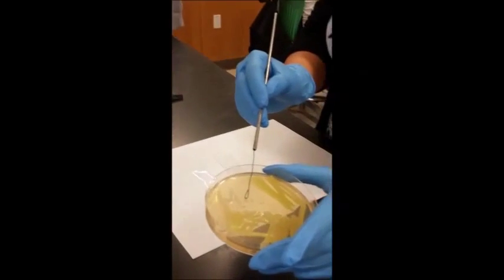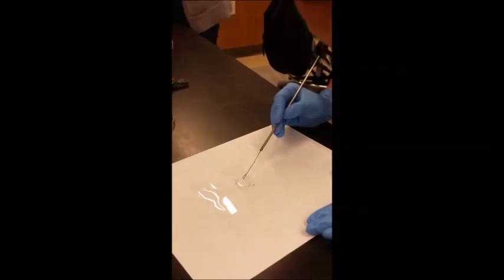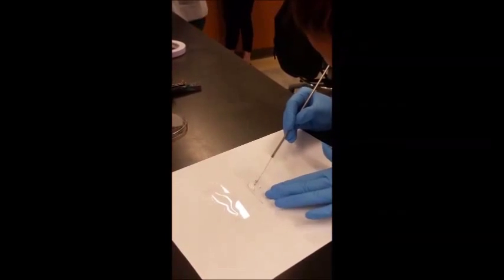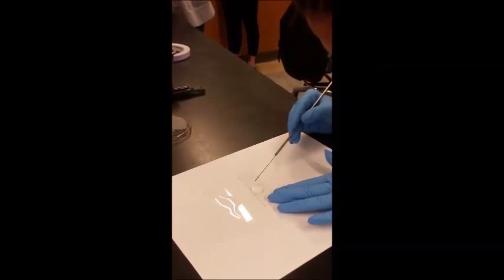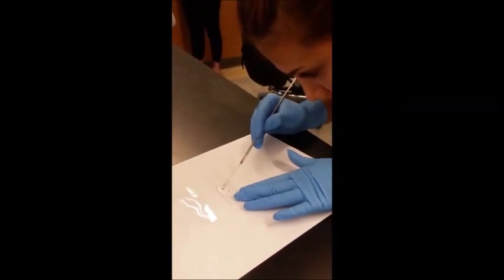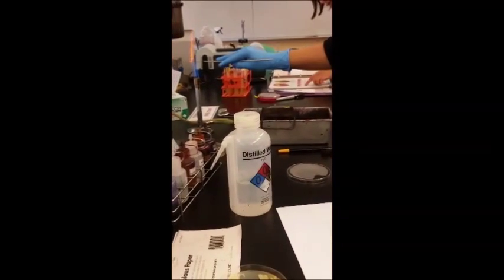And then we just take a little bit of the culture of the organism, just a little bit, and then try to spread it all over the slide, I mean all over the circle we made. Very smooth. And we just let it sit for 5 to 6 minutes to let the slide dry.